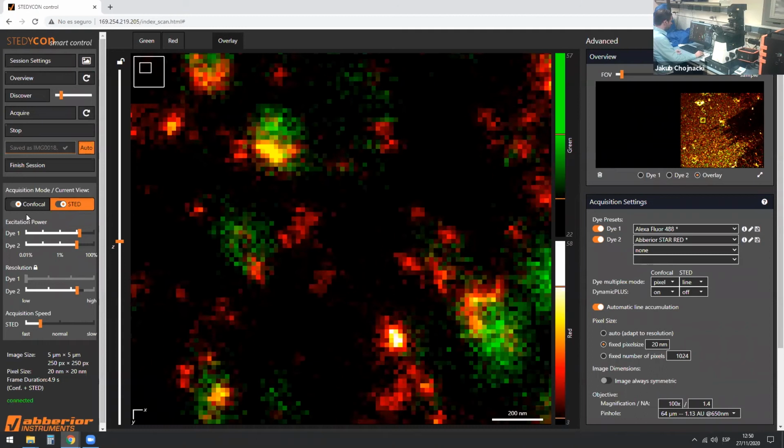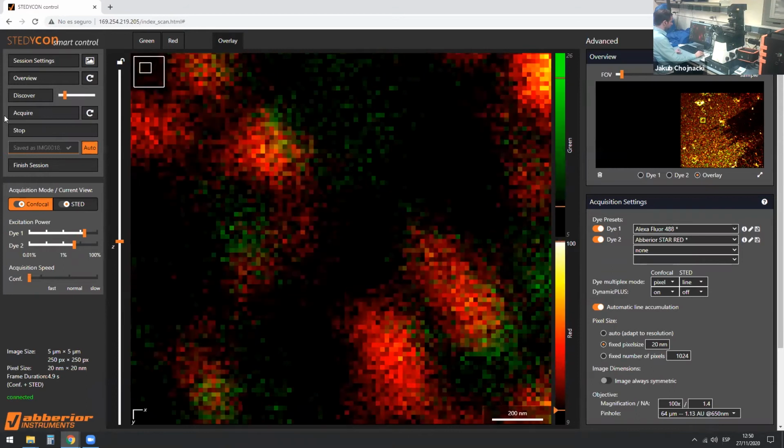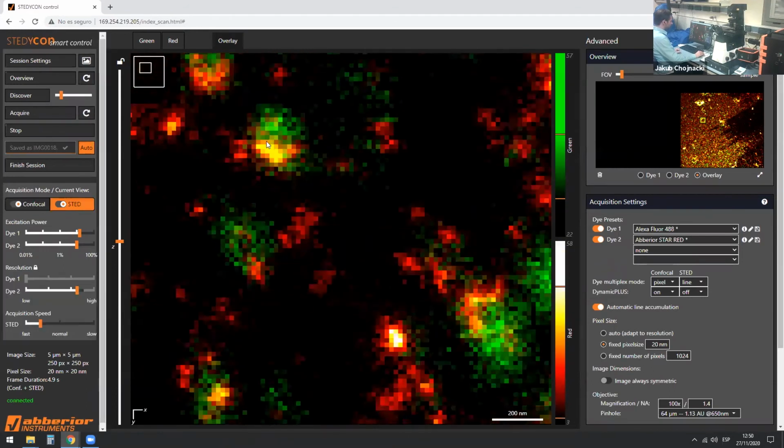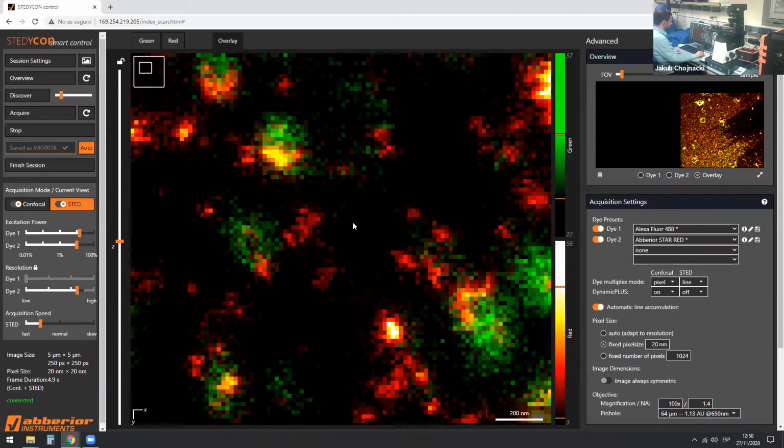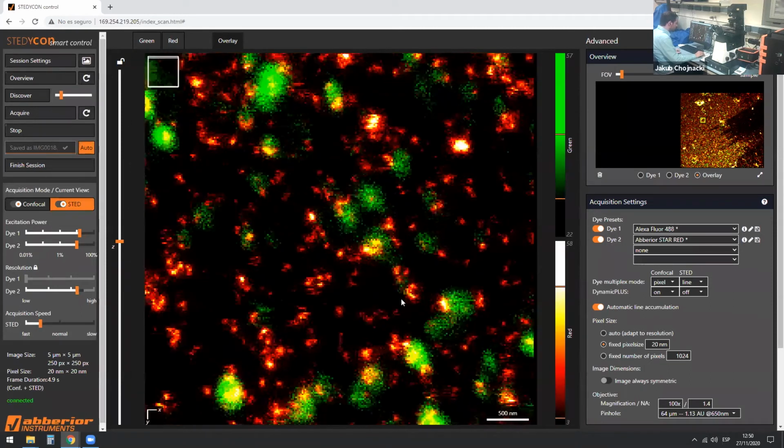Yes, so when you compare it to a confocal image, as you can see, it's just a gigantic blob. But we see here that those envelope proteins are a little bit on one side of the virus particle. Interestingly, because for example, I think I saw it here. Let's see. This one doesn't.